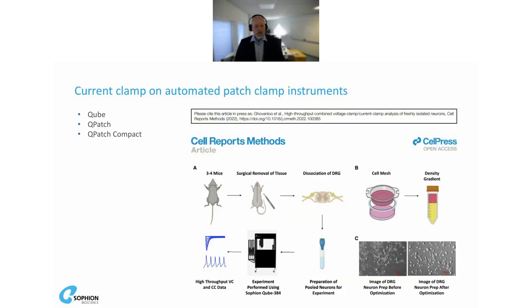But it's of course not only voltage clamp that is of interest out there. Actually, you could claim that nature is current clamped. Often we only look at voltage clamping in the laboratory because it is, you could say, easier to make quantitative measures, making IC50 values of various compounds.